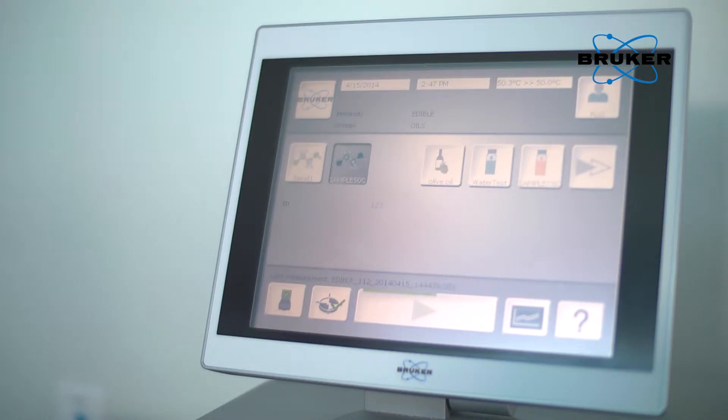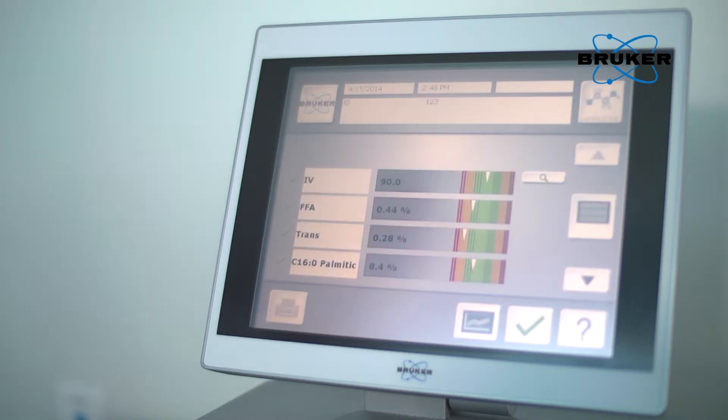After approximately 15 to 30 seconds, the measurement is complete. The result view shows the quality of the analyzed product immediately.